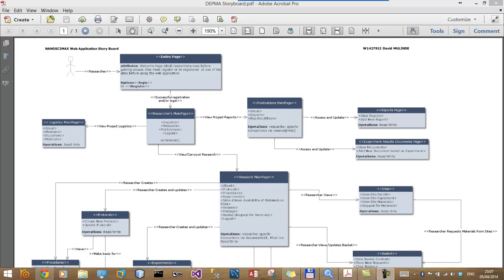So it needs to have an executive summary, as well as the name of its creator and the date and time when it was created. When an experimental protocol is available, any individual researcher or cross-lab experimental team of researchers can then go ahead and conduct one or more experiments based on the procedures of that protocol.